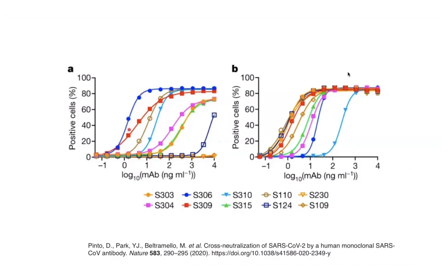That's how you would interpret one of these curves, by looking to see what's most to the left, what's most to the right. We can compare between them, so we can say that this one is higher affinity than this one, and things like this. We can also remember that this is on a log scale, so we can't tell anything by the shape of this curve. This is not telling us it's cooperative binding, because everything is going to look sigmoidal on a log scale. This is basically just showing us the binding curve, nothing about cooperativity.